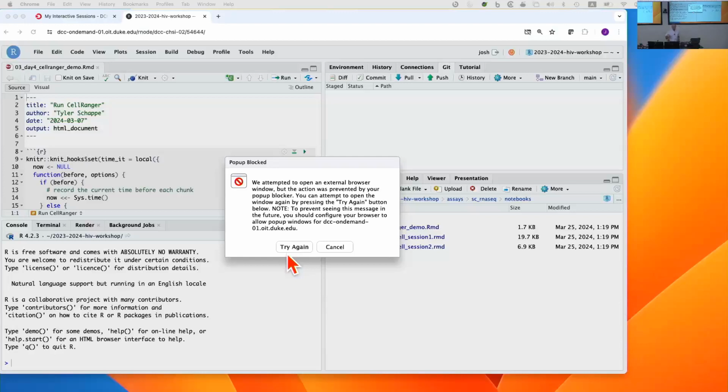So for microRNAs, I'm guessing that people are using UMIs for the multiple counting, to collapse multiple reads that came from the same molecule down to a single count. But I'm not 100% sure without doing a little background reading. Other questions?